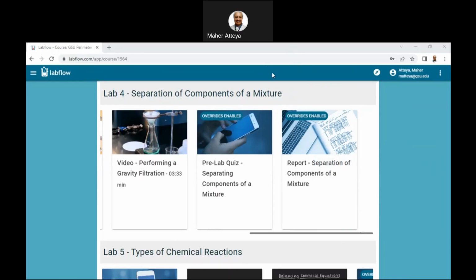Okay, copy, and I'm pasting the whole thing here. Paste. So now, just to let the students know, of all those files only two are very important for us. So I'm inserting a shape, just to show you what the important ones are.